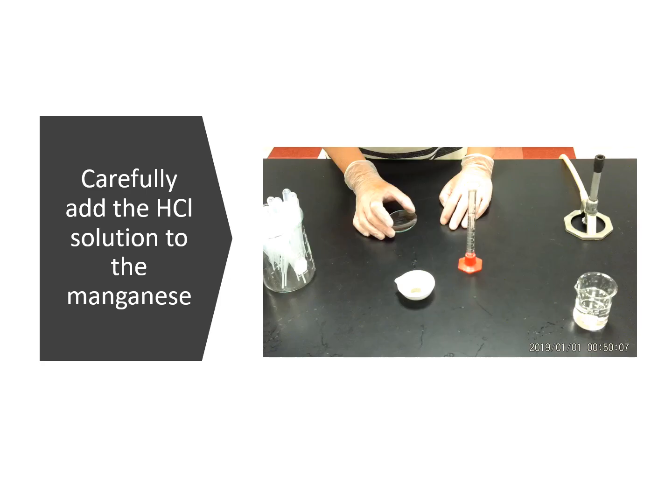When you add your hydrochloric acid solution to the manganese, let me see if I can show you how that works.